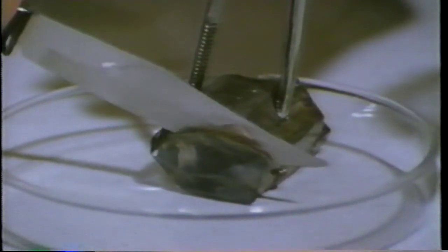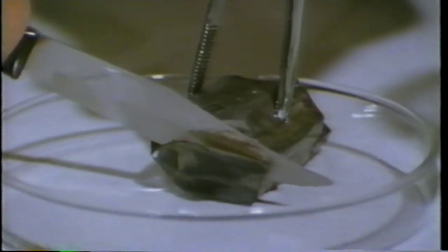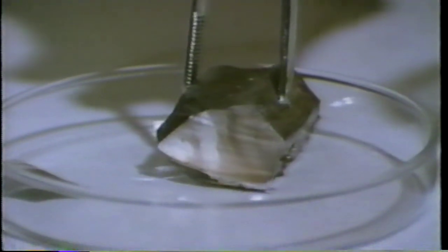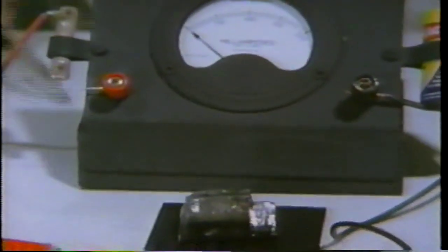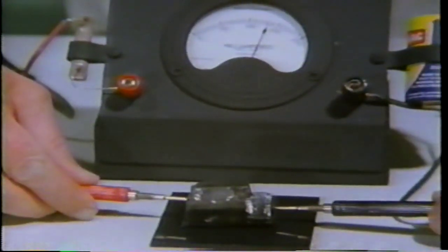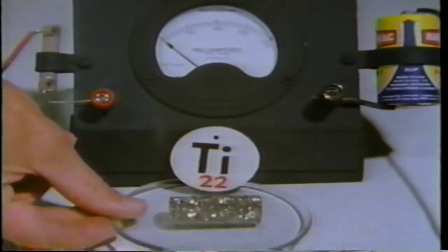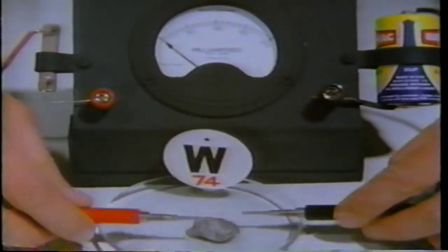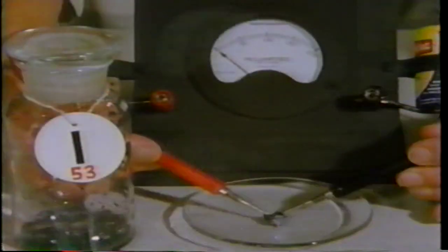Lithium is somewhat ductile and looks metallic. Like potassium, its clean surface reacts with air. The lithium turns black, except where covered with oil. The shininess and ductility of lithium indicate that it is a metal, so we expect it to conduct. It does. We proceed with the task of sorting elements into metals and nonmetals. Some conduct, and some do not.